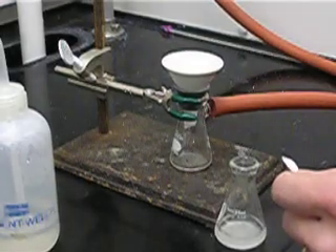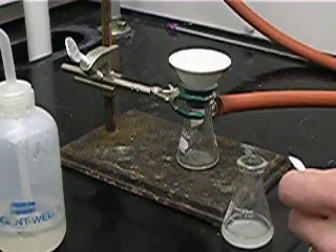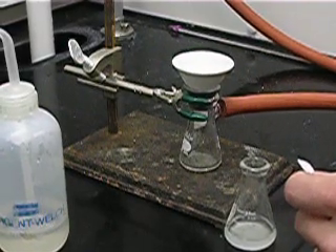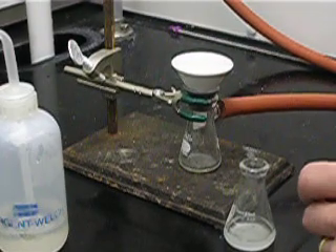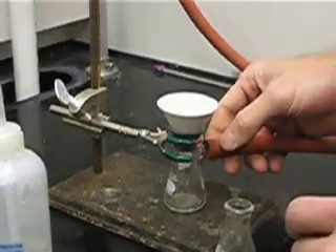We will start to hear vacuum being applied — the noise of the water. We turn the valve on all the way so we have maximum vacuum applied through this red hose.